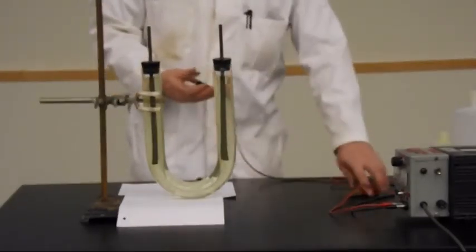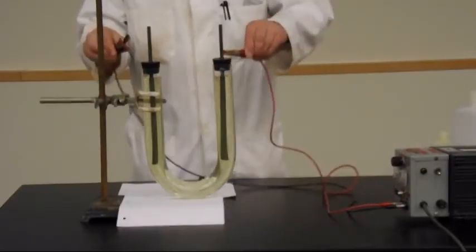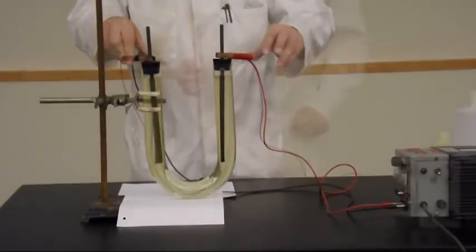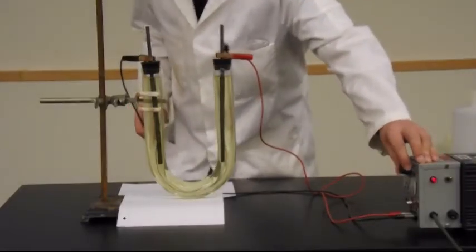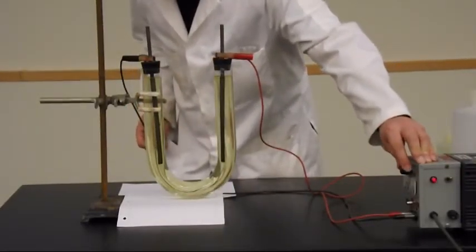These are two graphite rods that I'm using as electrodes. They are both inert electrodes. They don't take part in the chemistry. They're just there to pass current. So all we're going to do now is just turn it on and apply an electrical potential.